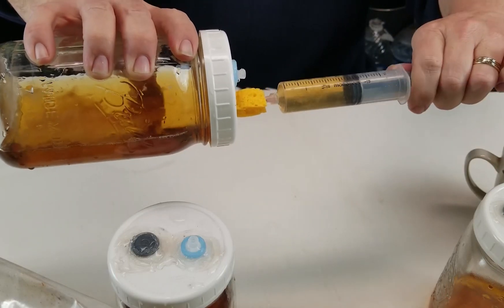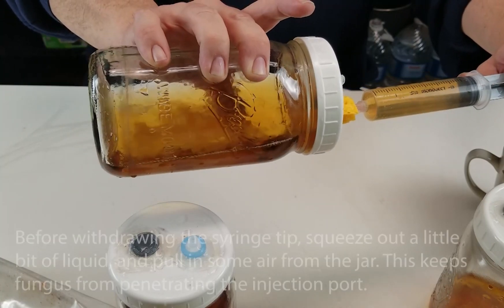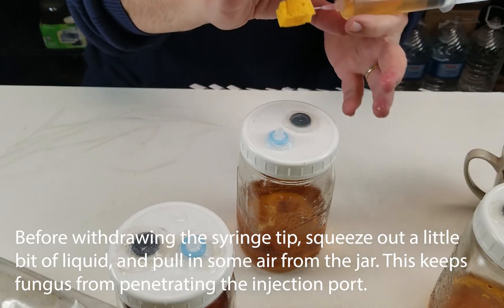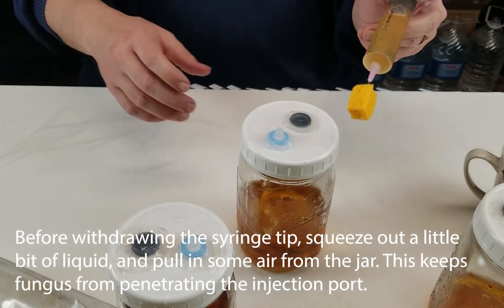Laboratory stir bars are sold online, and you can use a magnetic stirrer underneath it. But that will cost you a bit of money, and I tend to go kind of low tech, so I run mine without the stirrer, and I just give my jars a swirl now and then to break up the mycelium.